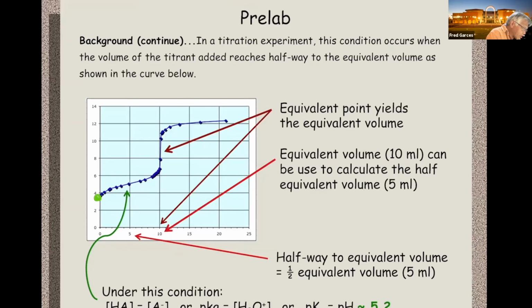Okay, so this is what the titration curve feature will look like. You're going to start low, go through a buffer, hit the equivalence point, and then tail off. So the experiment itself will require monitoring the pH and then titrating way past the equivalence point, so you can see this tail. In the past, students would stop right here, and that's not good because you don't know whether or not it's still doing this or something.